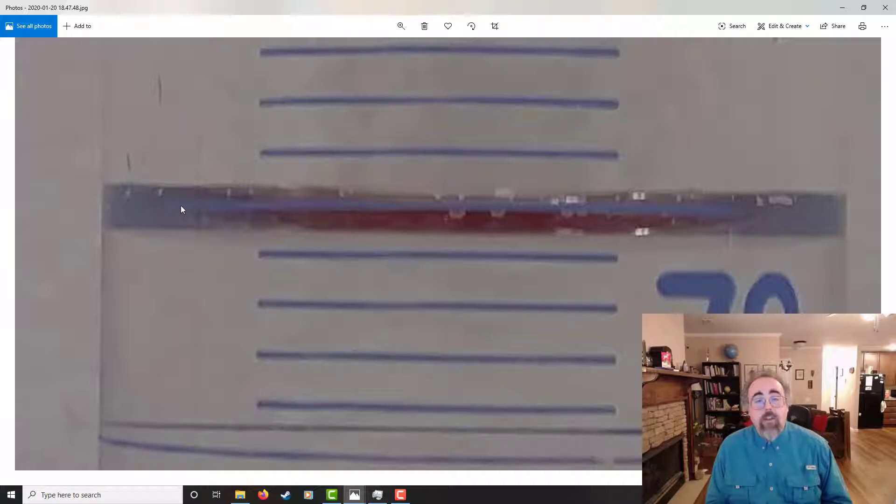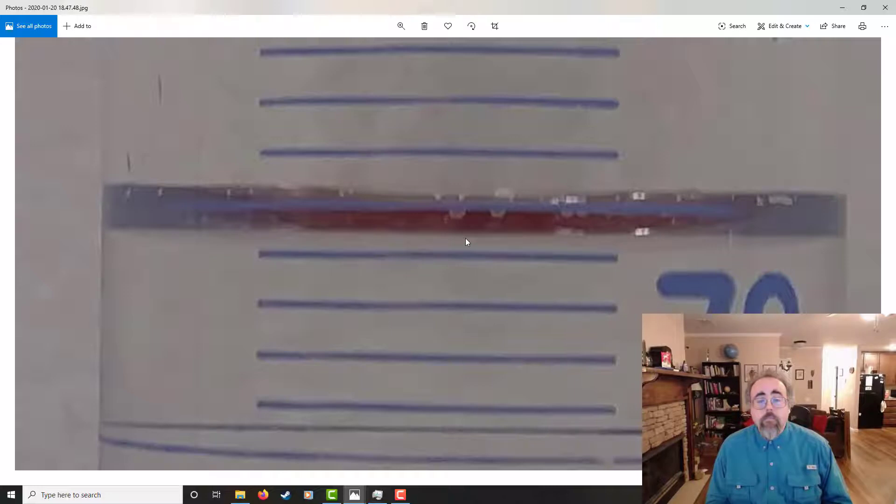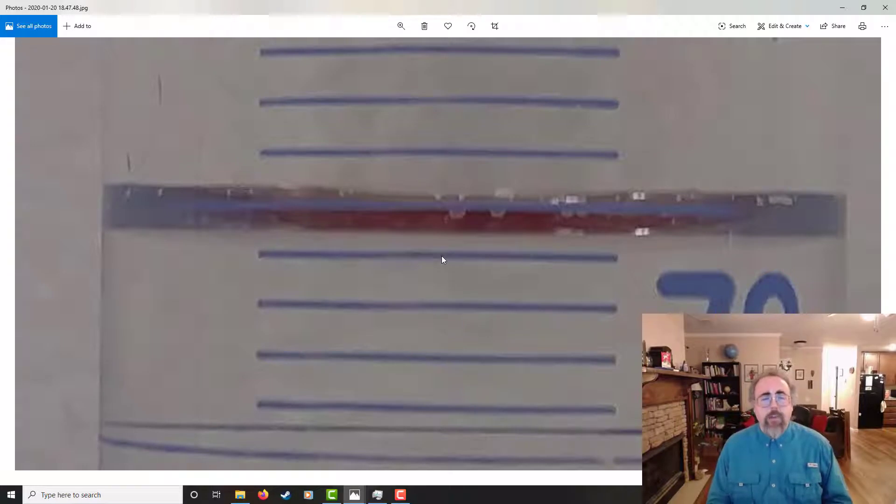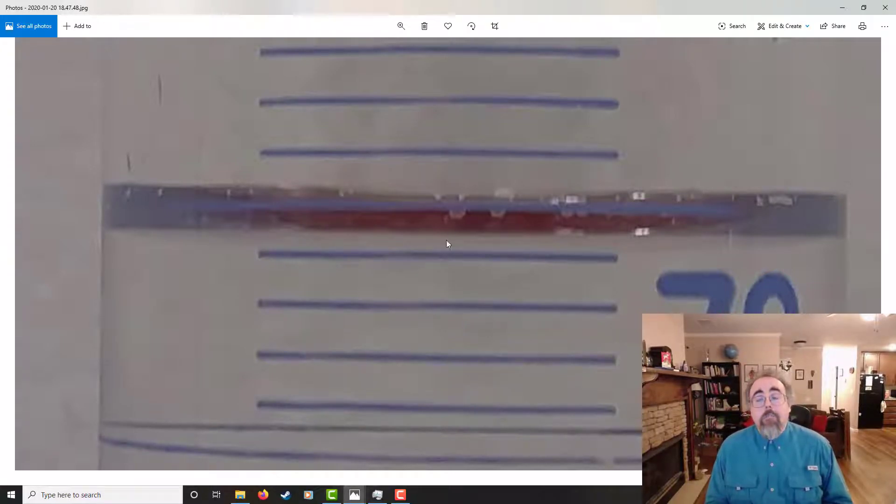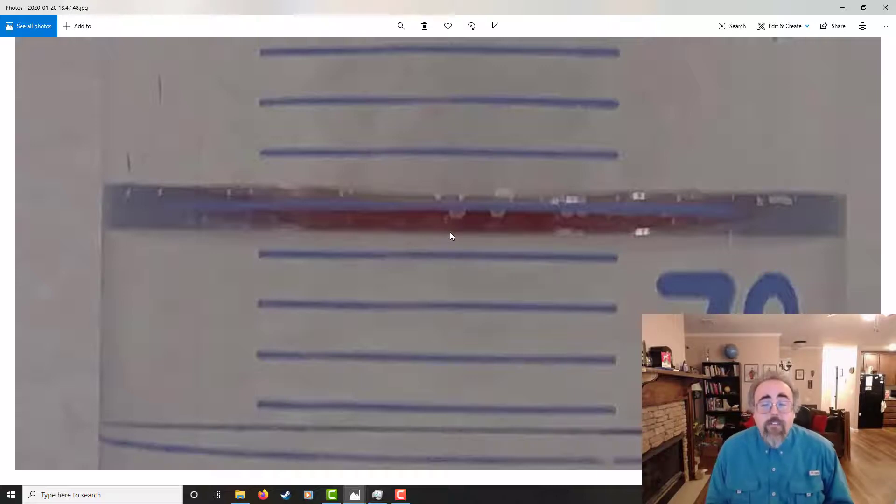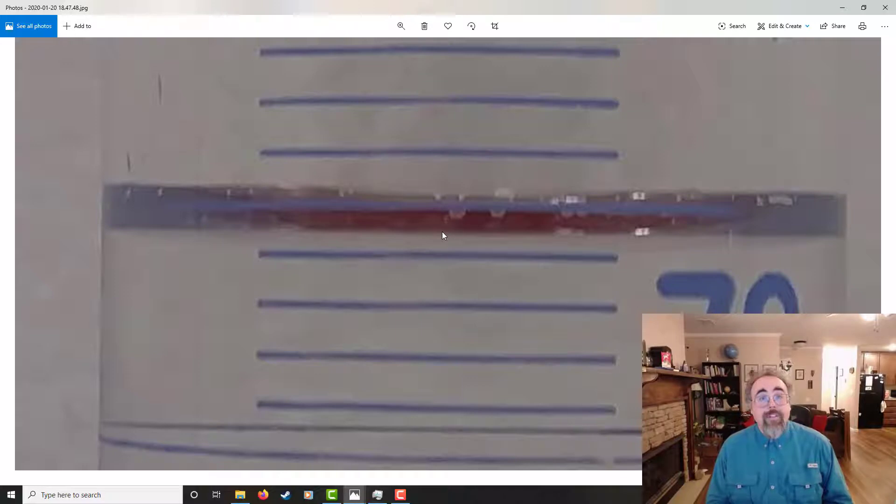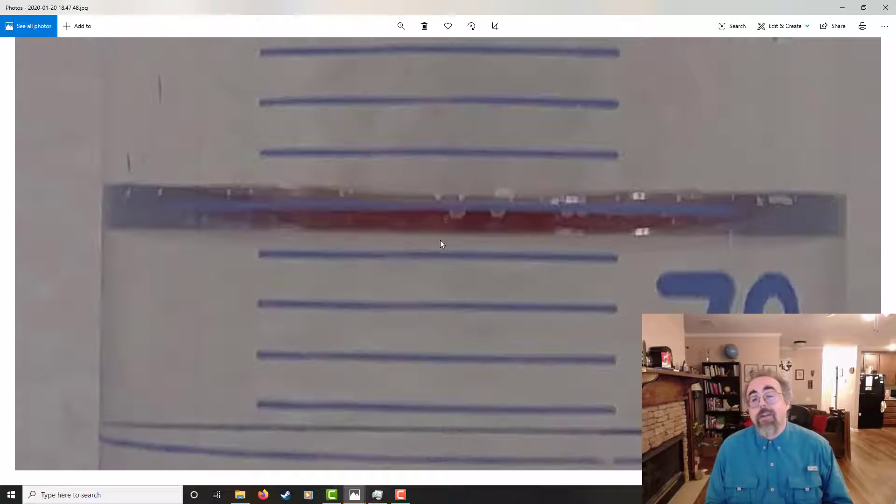But these longer lines, see how this one's kind of a little bit longer? That's usually a counting aid. Definitely useful. Okay, so I'm in between these two lines. I could just say it looks close to the 74, I'm going to call it 74. But that's actually throwing away good data. There's only two sig figs, and I can get three. Honestly, this is 74 and a half, a little bit less. I'd say it'd be 74.4. And that's what I'm going to say.